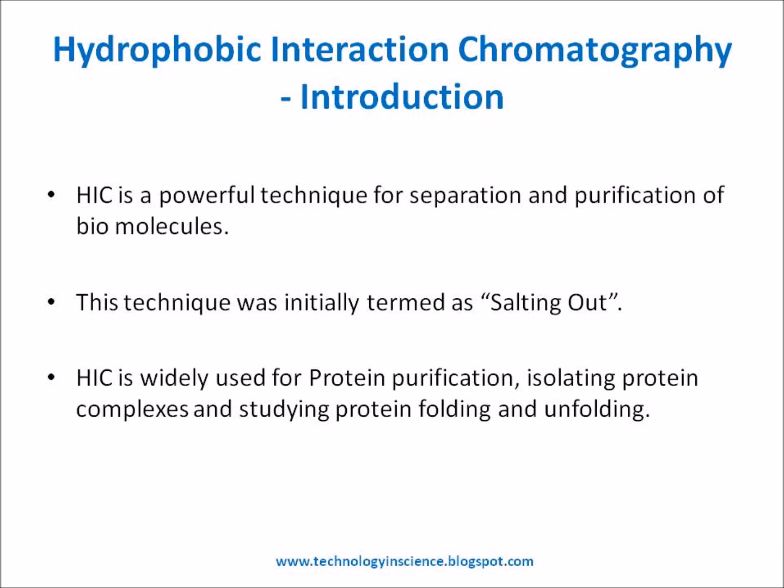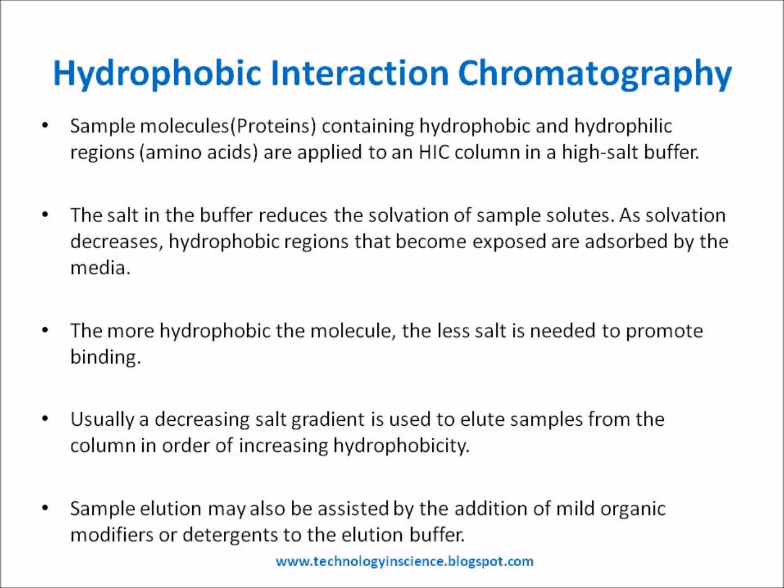Hydrophobic interaction chromatography was initially termed salting out. It utilizes the reversible interaction of protein and the hydrophobic ligand for the separation of protein mixtures. Proteins separate out in the increasing order of hydrophobicity.